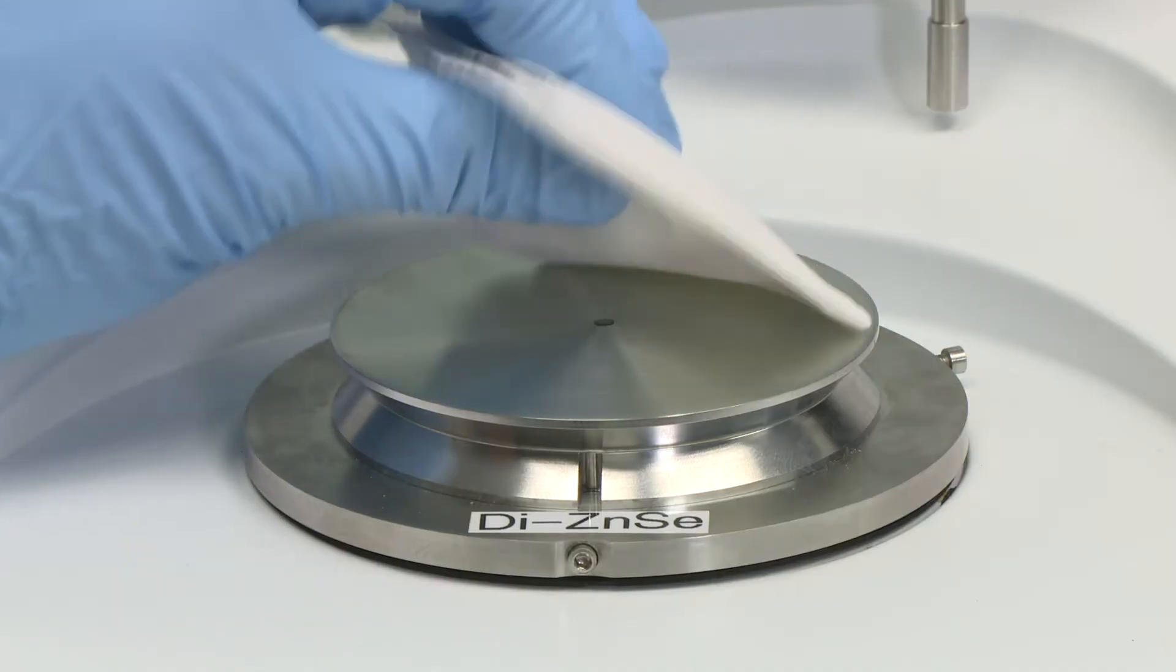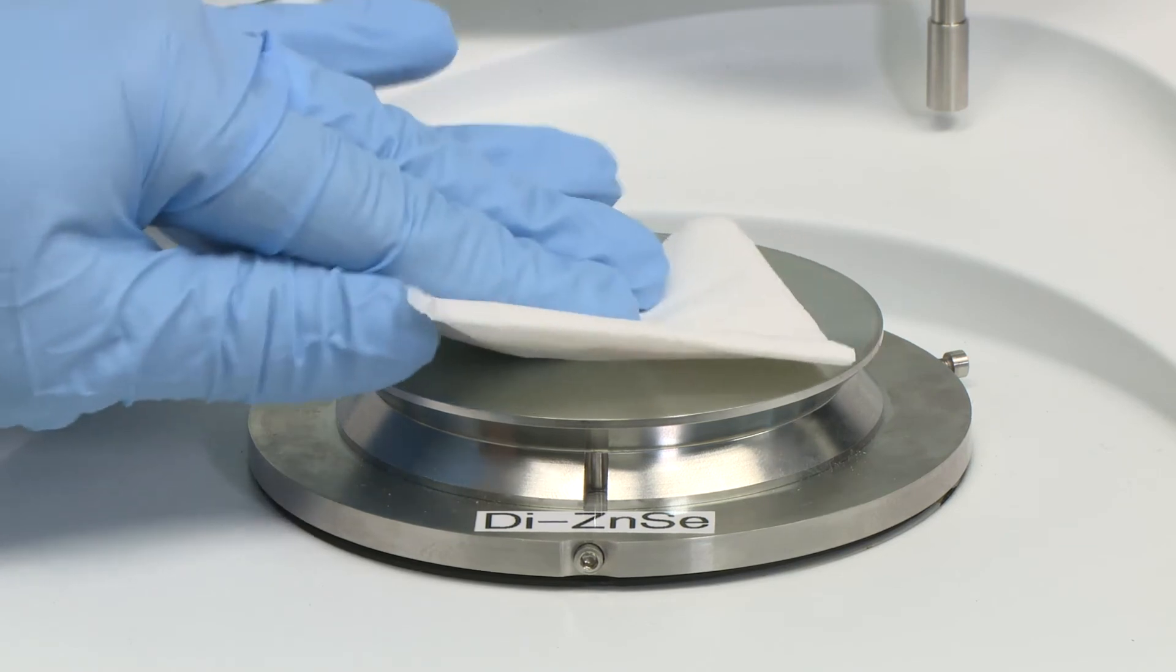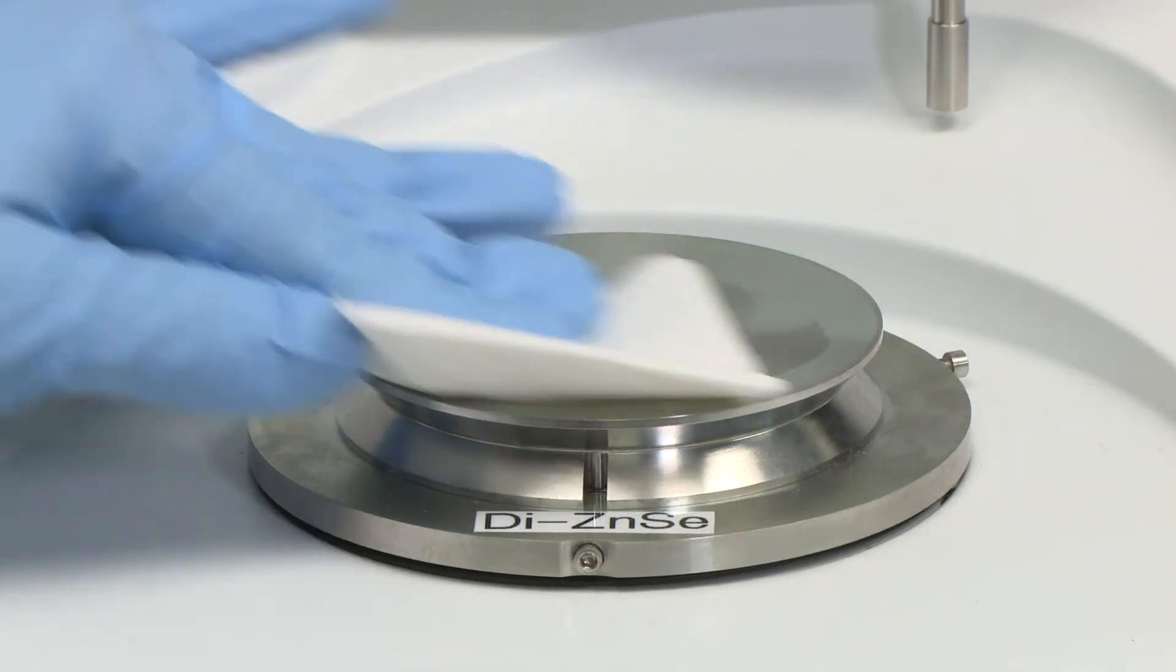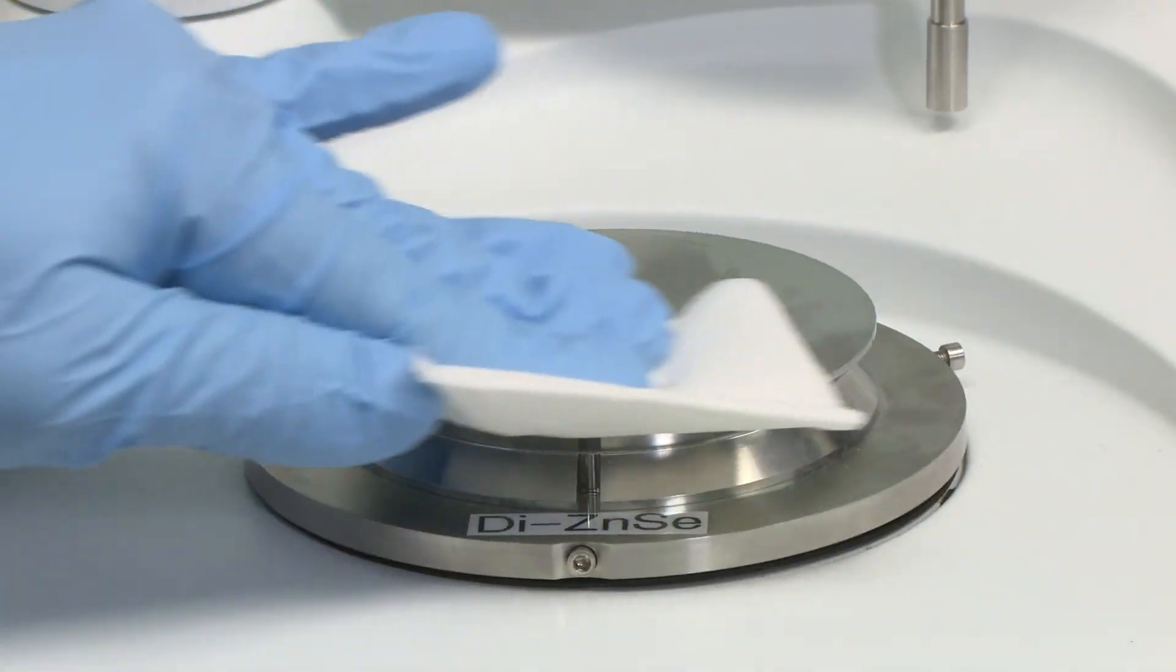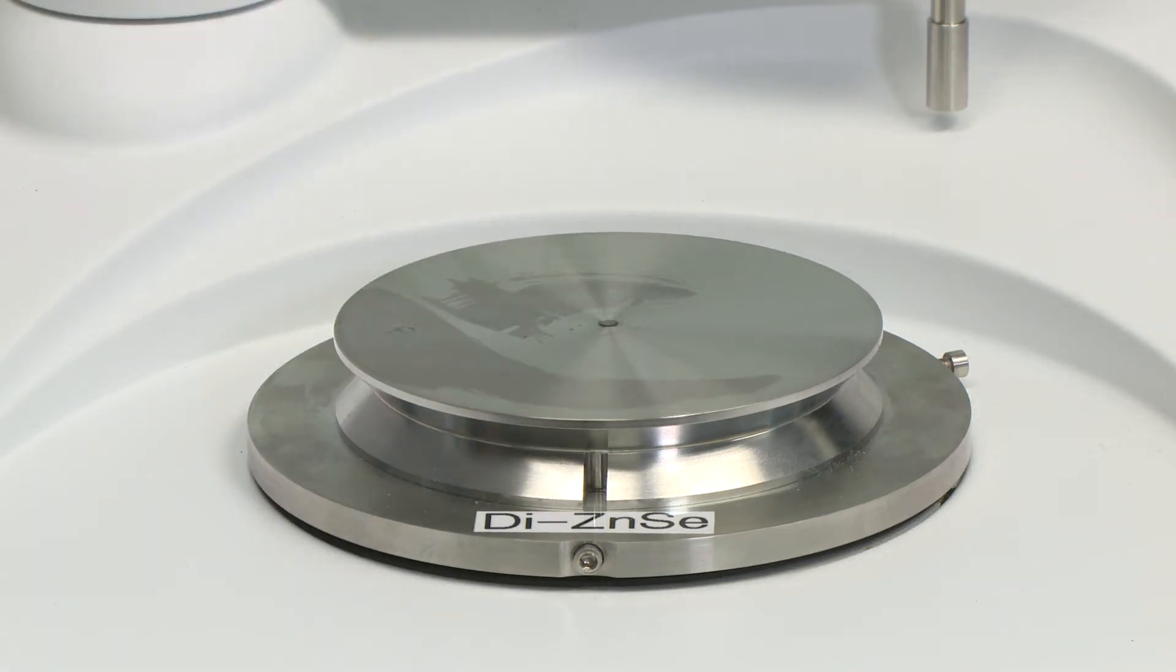You're going to want to clean the crystal in an outward fashion, so start in the middle and do a circular outward fashion. This pushes any kind of sample that may have been on the crystal to the outside of that crystal.